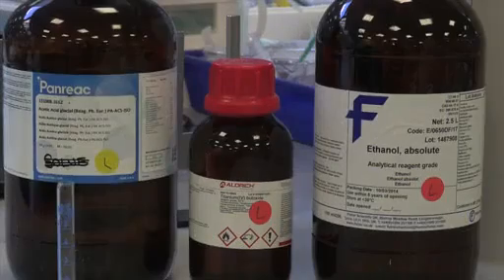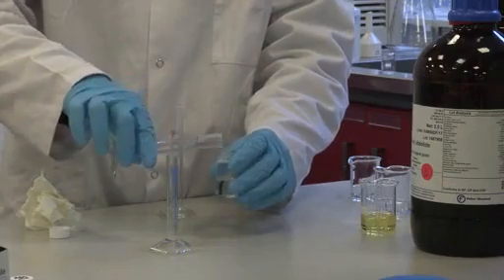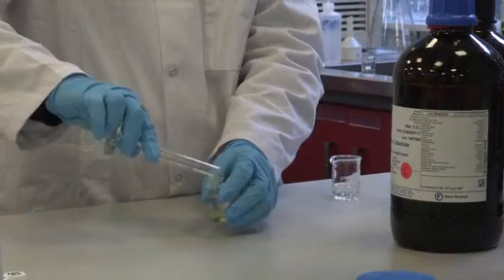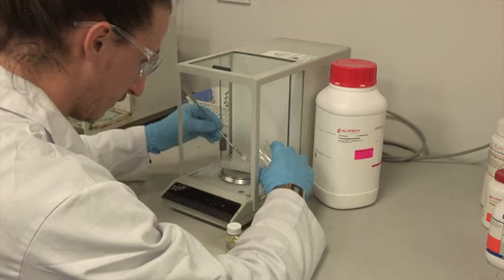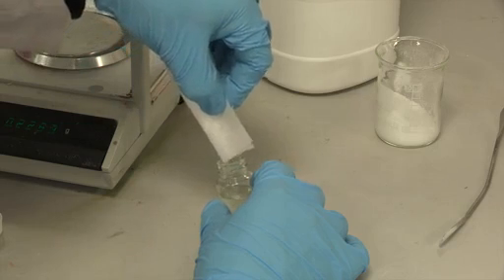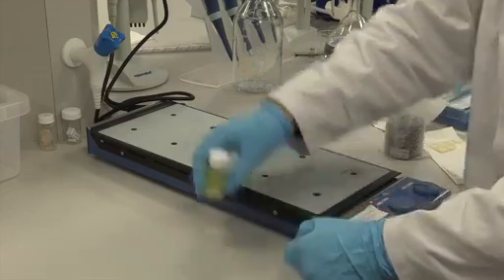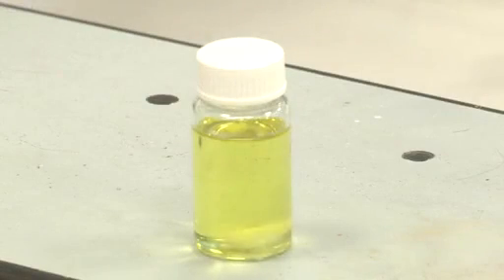To make the precursor solution, place 10 ml of absolute ethanol, 1 ml of glacial acetic acid, 5 grams of titanium butoxide, and 1 gram of PVP into a sample vial. Mix the solution until it has become homogeneous and no bubbles can be observed.